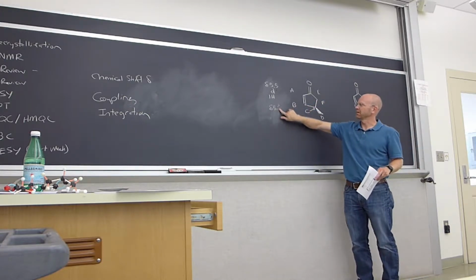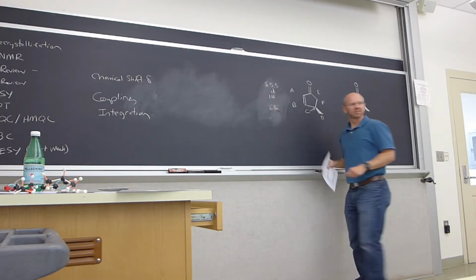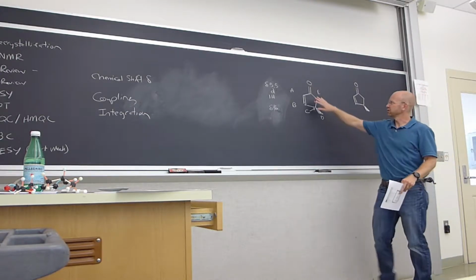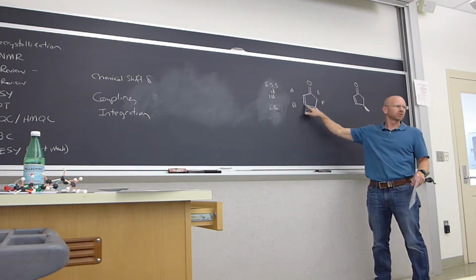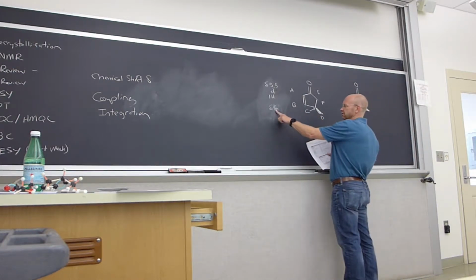So actually we should probably move it the other direction. Let's call it 6 because of resonance. Okay? So the alternate resonance form has a negative charge on the oxygen and a positive charge there. Okay? So 6 is our shift estimate. Then how about coupling?